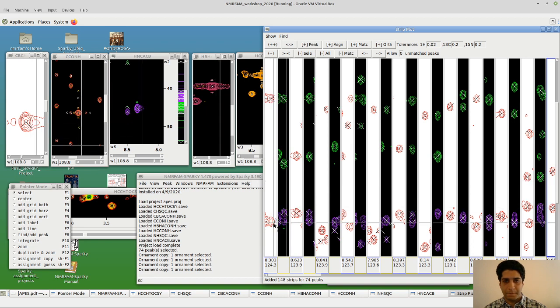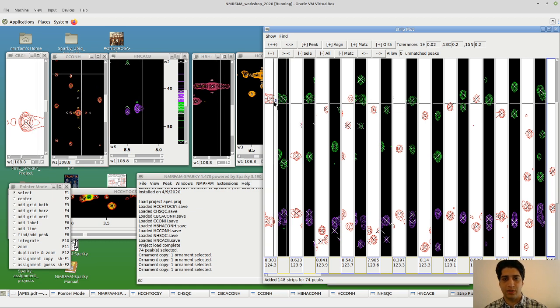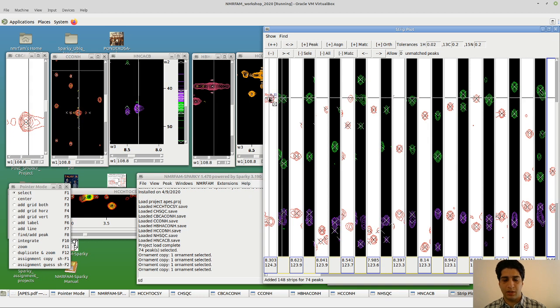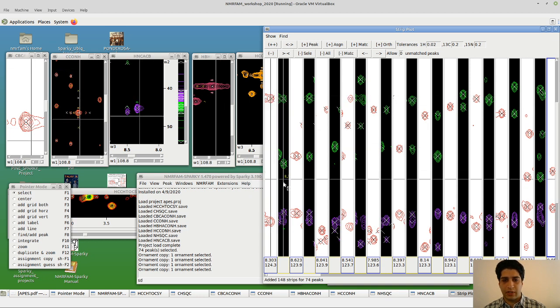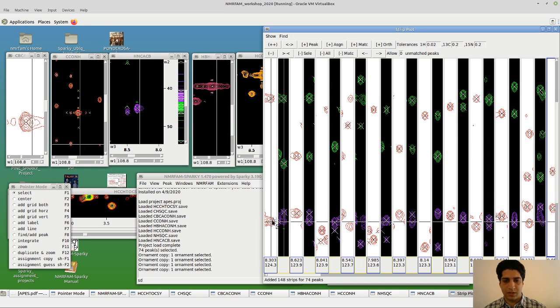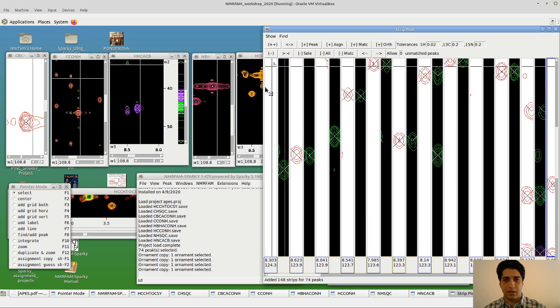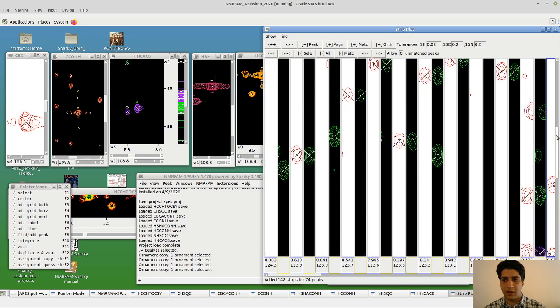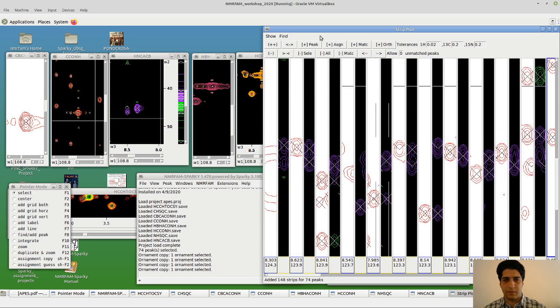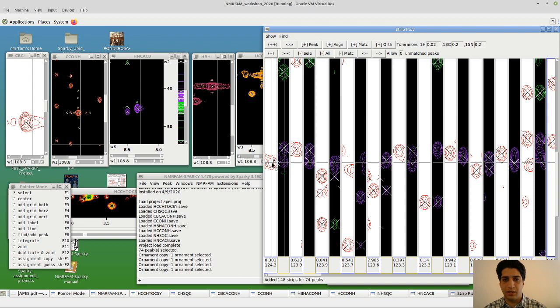Okay, this is an exception that we haven't seen before. So we have 1 peak here and we have 3 peaks here. So this means that this is going to be another peak that was missing. Yeah, here. So we can add this missing peak here.